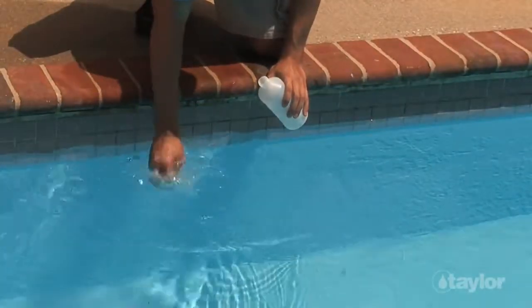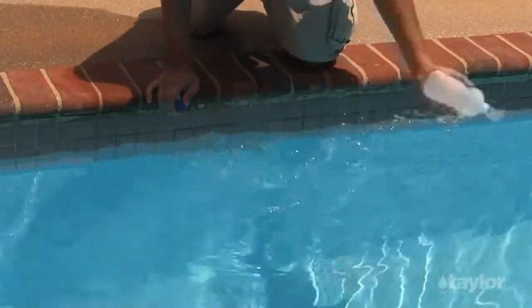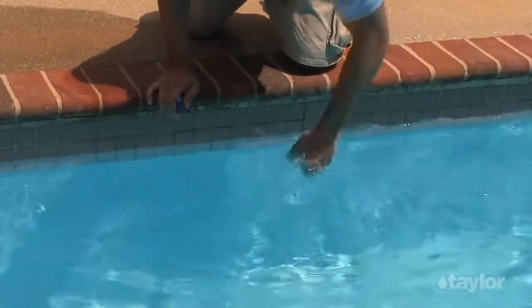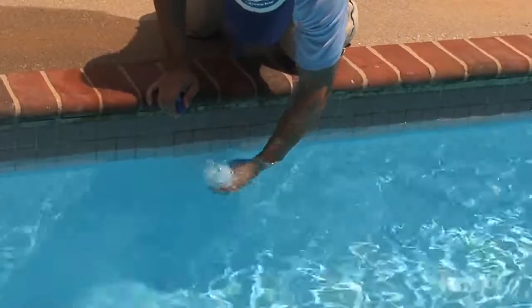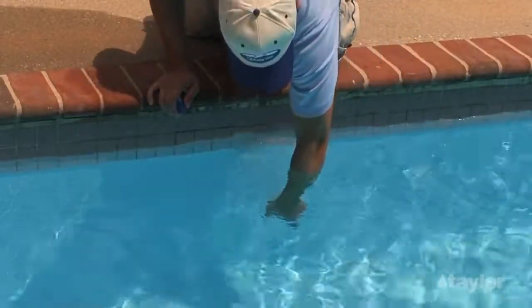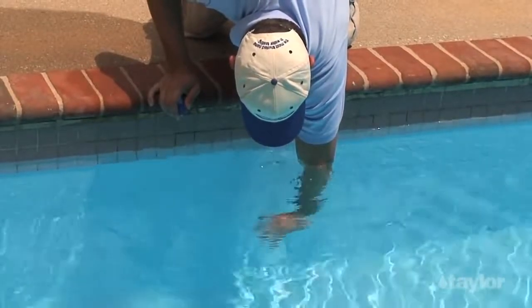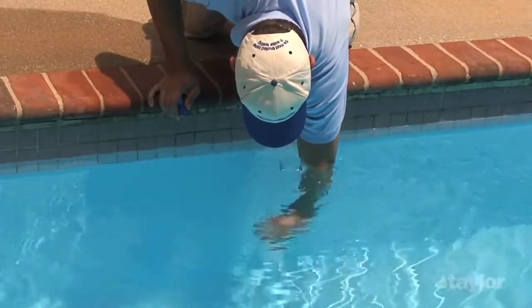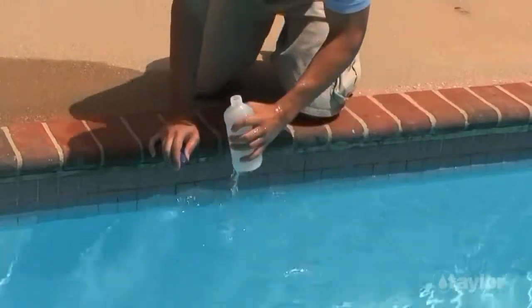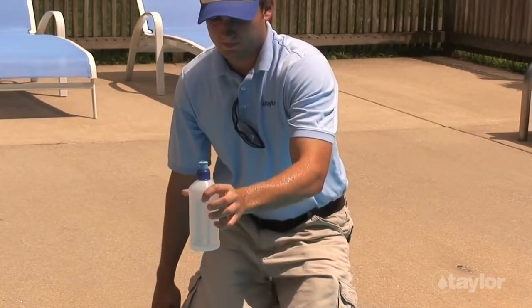Rinse both the bottle and the cap several times with the water to be tested. When you're ready to take the sample, turn it upside down, then reach into the water to about elbow depth. Turn it right side up and let it fill all the way to the top. Cap the bottle when finished to preserve the sanitizer residual. Begin testing as soon as possible.